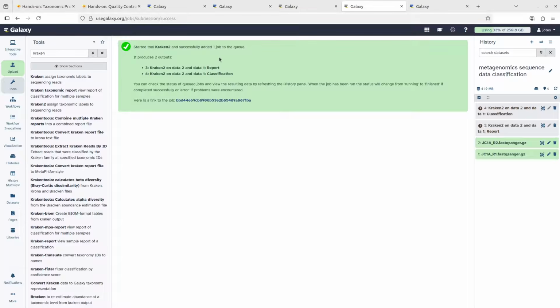And so once I've clicked it and it's successful, you see this happening. So the color changes from gray to orange, and so orange means it's working. So all that we have to do is to wait for it to be done. I think when I ran it for the first time, it took about 20 minutes or so, but let's see. So it should be done. So you just have to be patient and wait for the background to also turn green like this, then we will have our result. So let's wait for everything to get done for us.